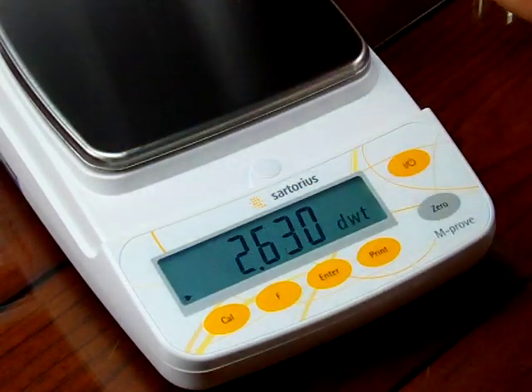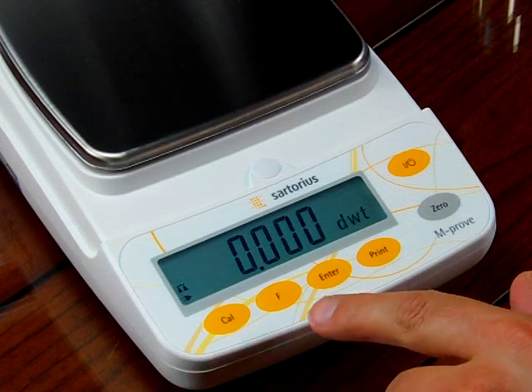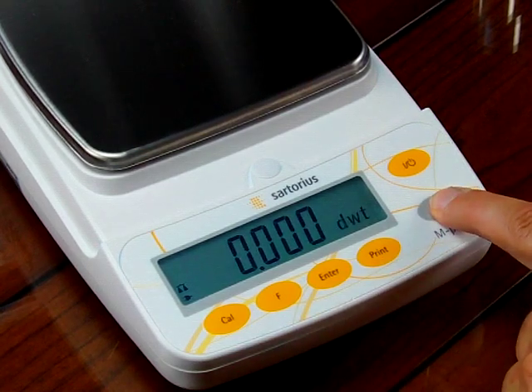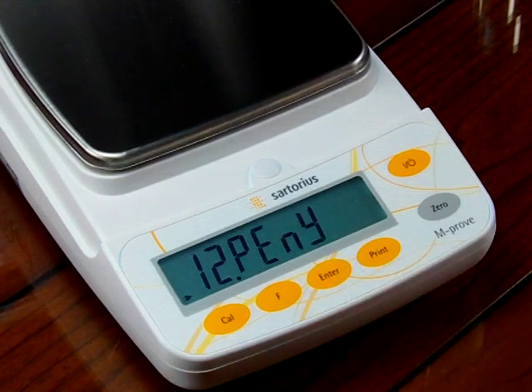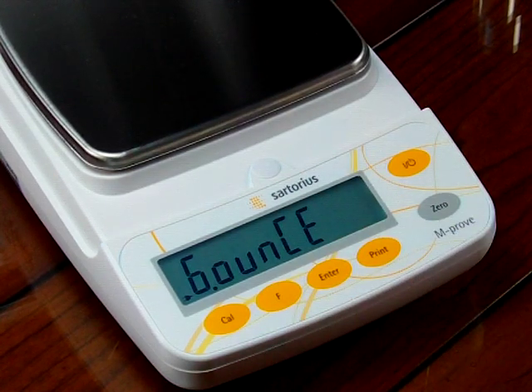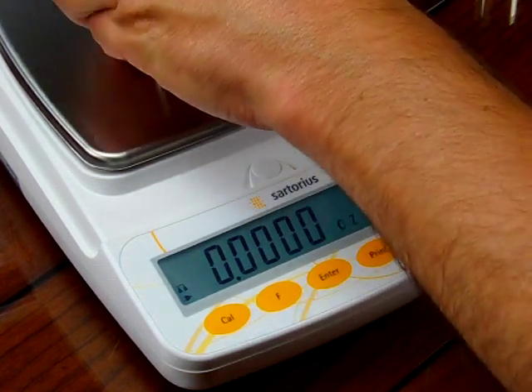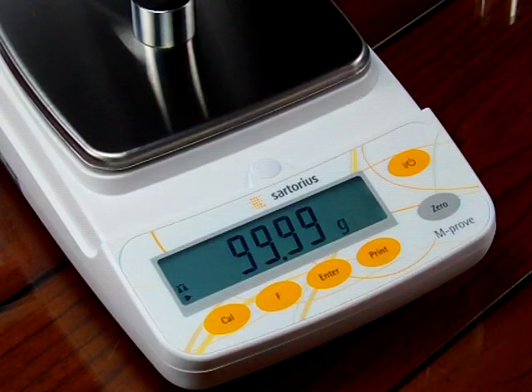Now say you wanted to change the weigh mode and you don't want penny weight — you want carats. To do it, we have to get back into that function by pressing and holding the zero key. We're in units. We're currently in penny weight, so we'll switch it to ounces instead. We press the enter key to store it — now we're in ounces. If I hit the F key, we go back to grams.